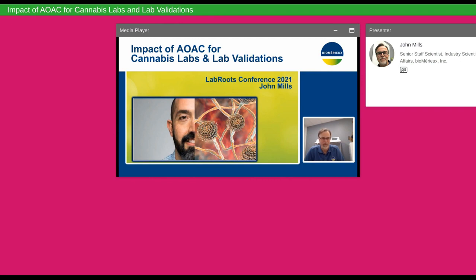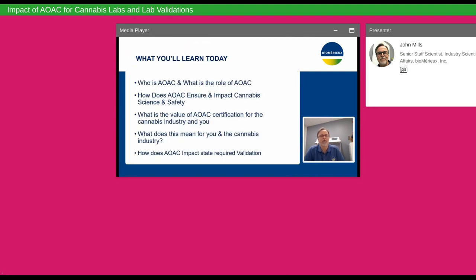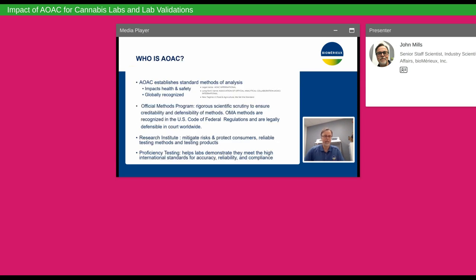Today, I'm going to be discussing with you the impact of AOAC for cannabis labs and lab validations. So what will you learn today? What are we going to talk about? Who is AOAC and what is the role of AOAC? How does AOAC ensure and impact cannabis science and safety? What is the value of AOAC certification for the cannabis industry and you? What does this mean for you in the cannabis industry? And how does AOAC impact state-required validation?